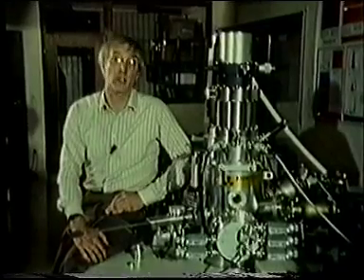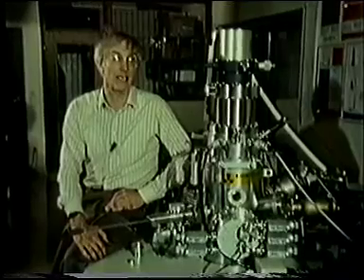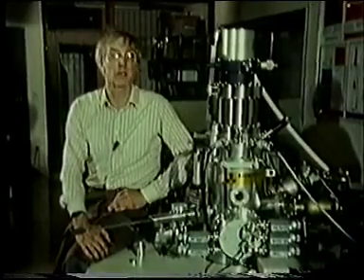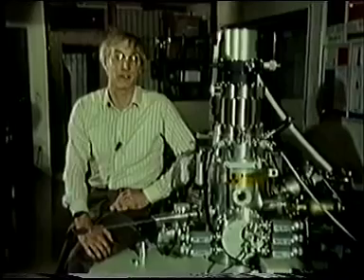Potassium is quite different. It occurs wherever the iron is, and at even higher surface concentrations. But the two elements are not freely mixed, as these maps might suggest. Now this instrument is equipped with an argon-ion gun, which can progressively remove surface layers. When we do this, we find that the potassium disappears almost at once. This shows that the potassium forms a very thin layer over the top of the iron surface.